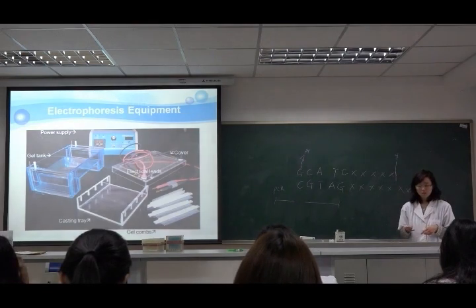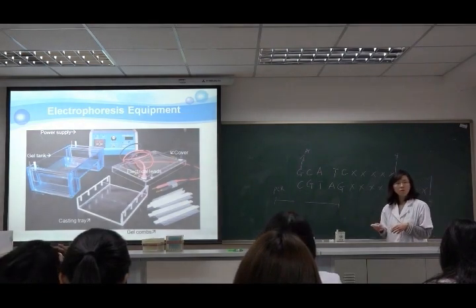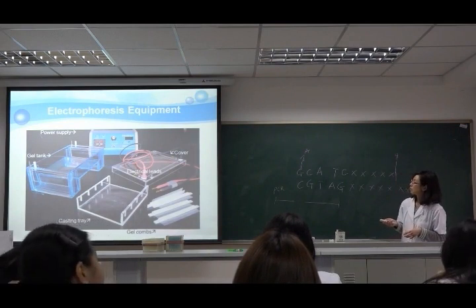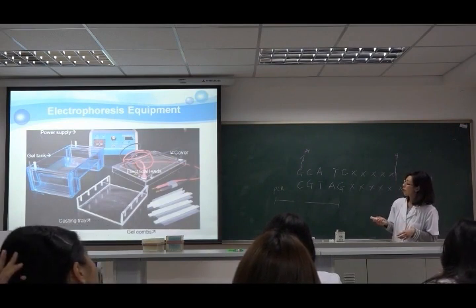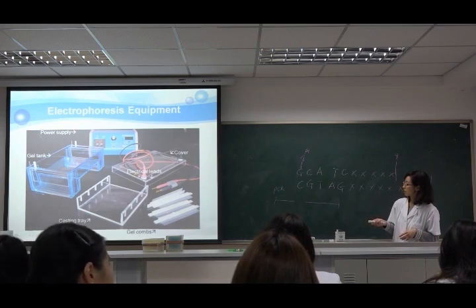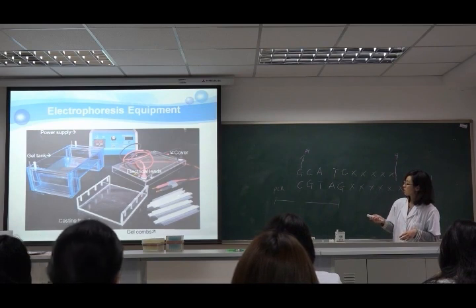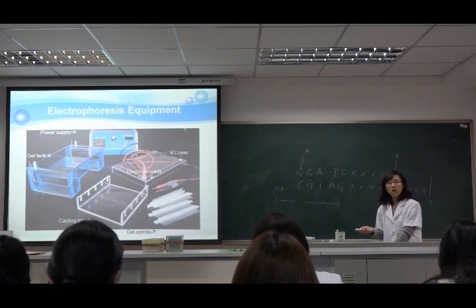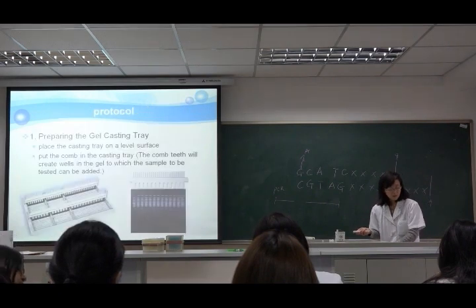And I will show you again because some students are late today. This is a power supply and this is a gel tank. This is a casting tray and this is the combs. And this is the cover. And this is electrical leads. And this is all the equipment for the gel electrophoresis.